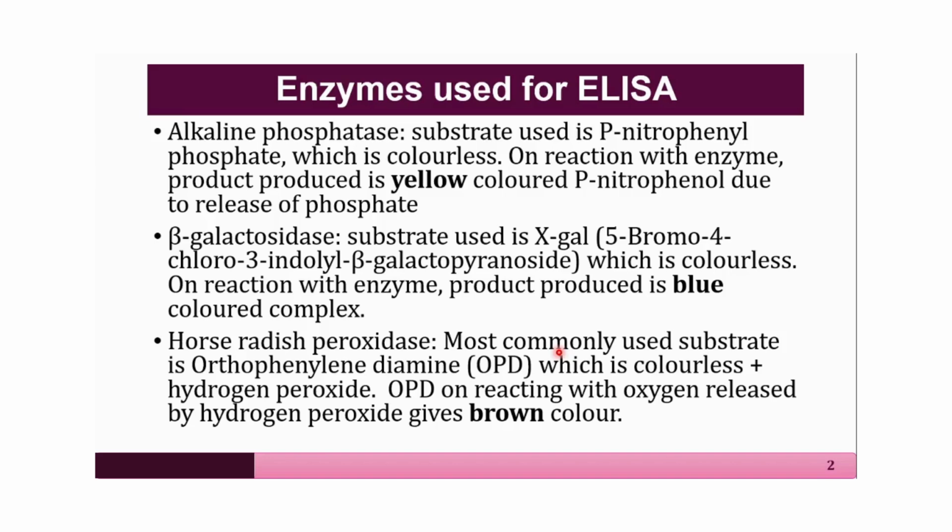That is by using biotin and streptavidin molecules, and streptavidin acts as a carrier for the enzyme, which is coupled to the enzyme, and streptavidin gets attracted to biotin, and biotin has strong affinity to the Fc arm of the antibody. This is how the enzyme is linked to the antibody molecule and the antibody becomes an indicator labeled antibody. The indicator here is an enzyme.